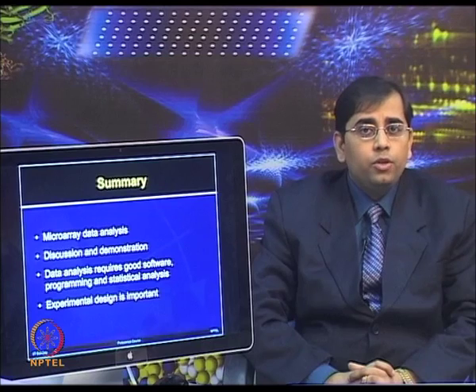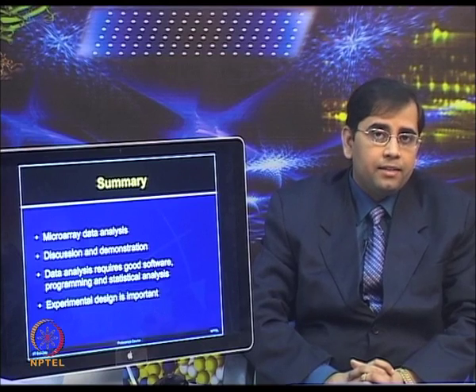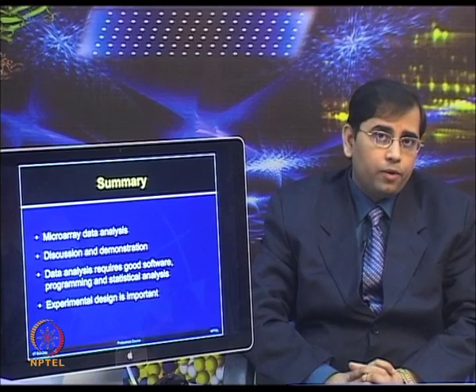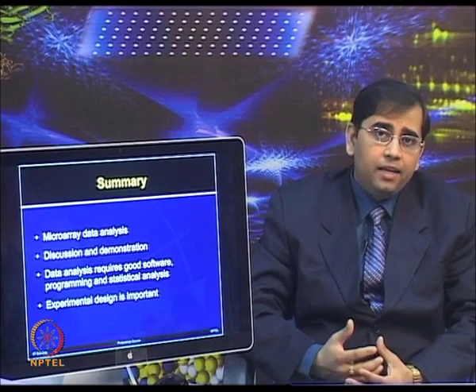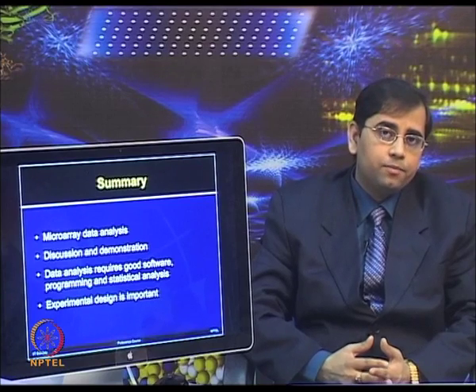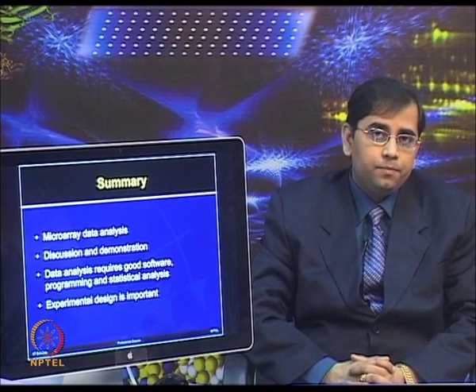of both the biology involved as well as the analytical techniques involved, rather than totally relying on one software. You should also think about the biological context, look at the controls, and then after careful biological as well as analytical analysis, you can probably obtain some meaningful information from these data sets.